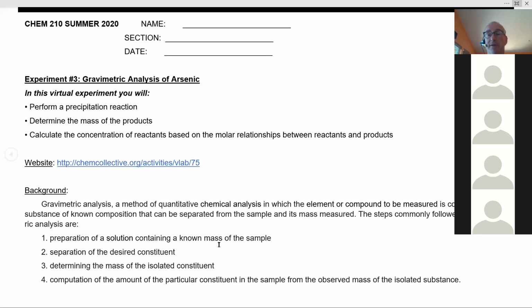And today we're going to learn about arsenic, which forms arsenates, because we know that "ate" goes on the end when an element combines with oxygen and forms a polyatomic ion. So we should all know arsenic's not very good for you, right? Arsenic is a poison. It's really toxic.